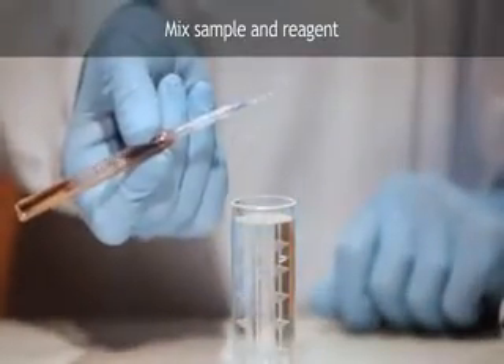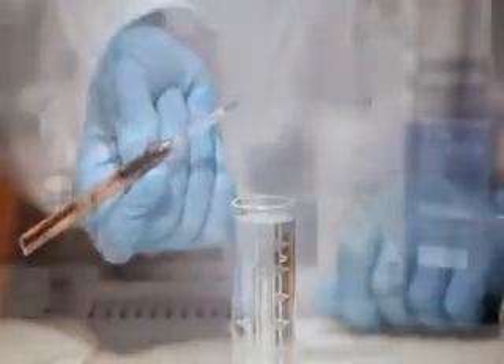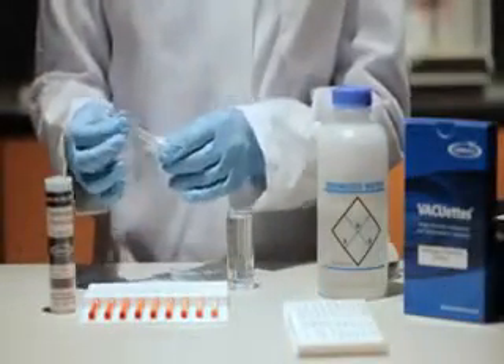Mix the contents of the ampule by inverting it several times, allowing the bubble to travel from end to end. Dry the ampule and wait for color development.